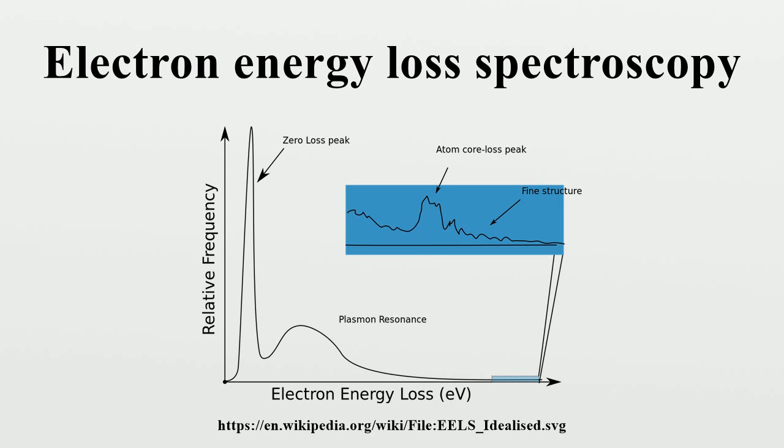However, the spectral resolution of most EELS spectrometers is often too crude for the small pressure-induced shifts. Therefore, the sensitivity and accuracy of this method is relatively poor. Nevertheless, pressures as small as 0.2 gigapascals inside helium bubbles in aluminum have been measured.